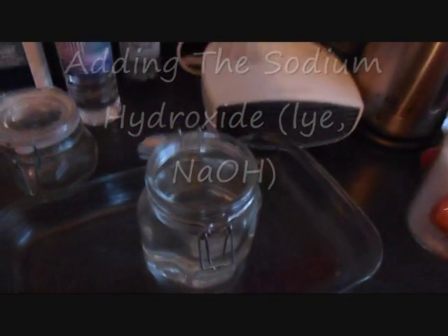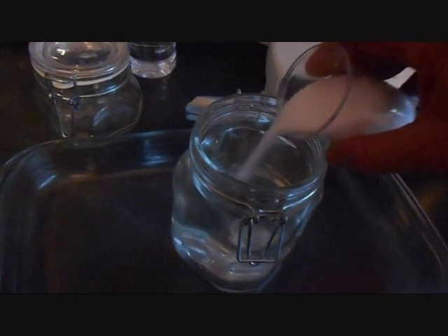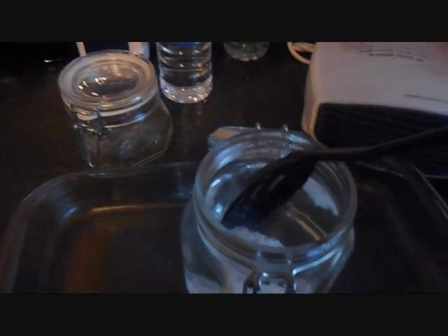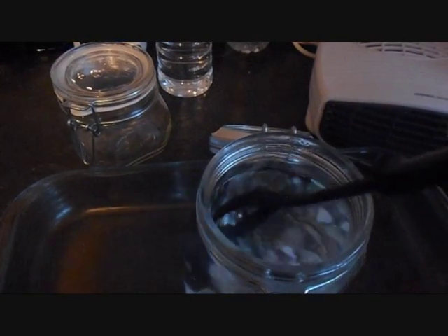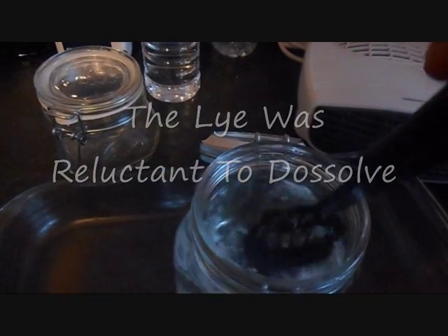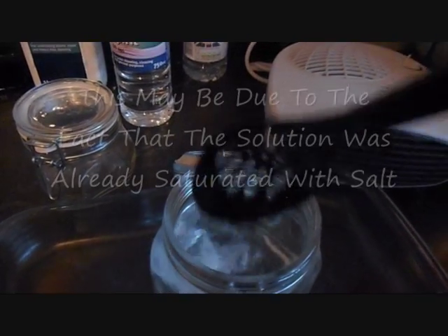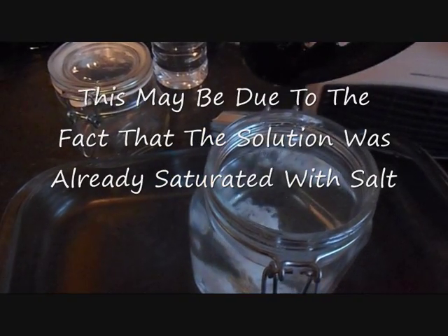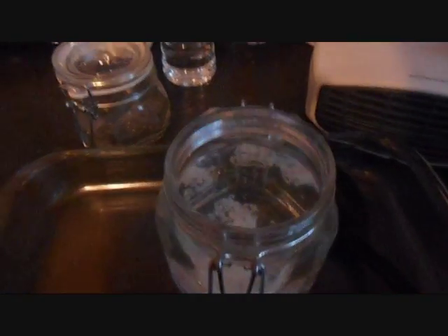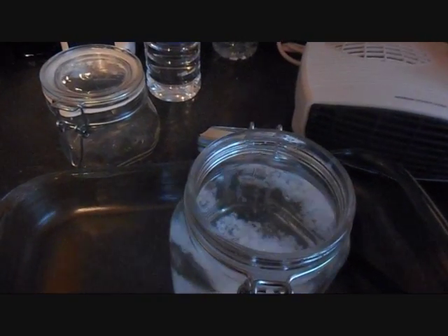Okay, so this has stood in there for an hour, so I'm going to start to add the sodium hydroxide, but a little at a time, because this will create a lot of heat. And I don't know, something weird's happening here. It's not dissolving. Well, that's strange. Well, that is odd. I'll keep adding it anyway because it's all I've got, but for some reason it's not dissolving.